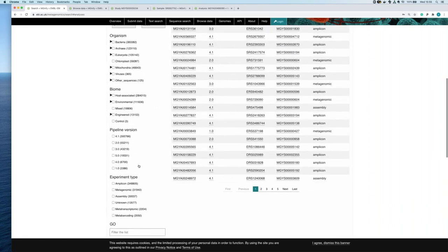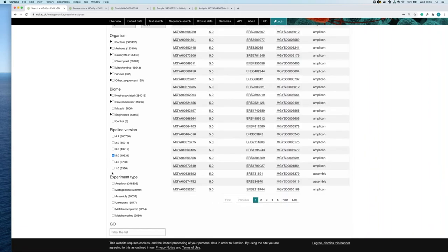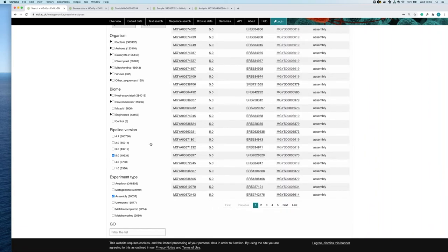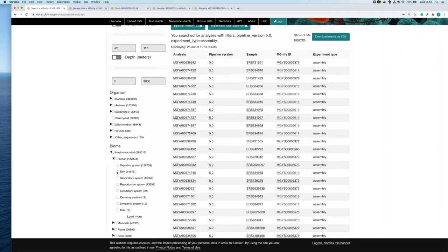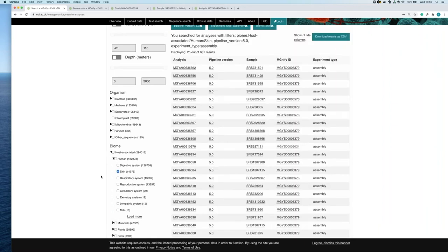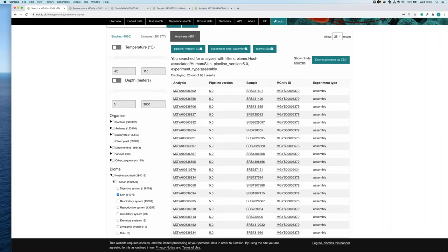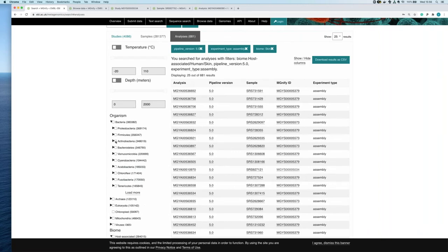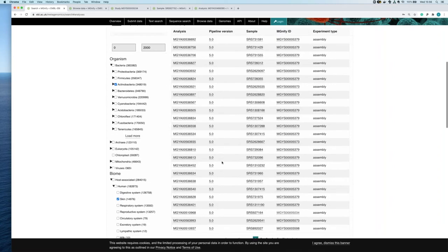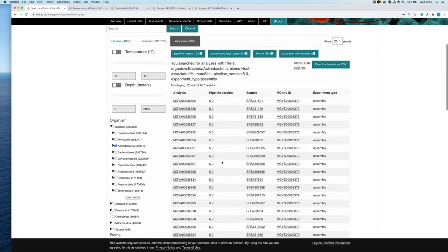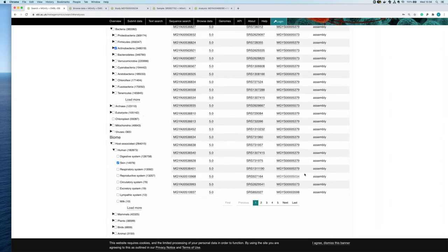For example, you can filter to look at the latest pipeline, only assembly datasets, only skin samples from a particular project, and drill down further to only those containing Actinobacteria. That gives you a list of analyses. I've picked one analysis at random and opened the study page, which shows the information we inherit from ENA along with external links to ENA and all associated analyses.